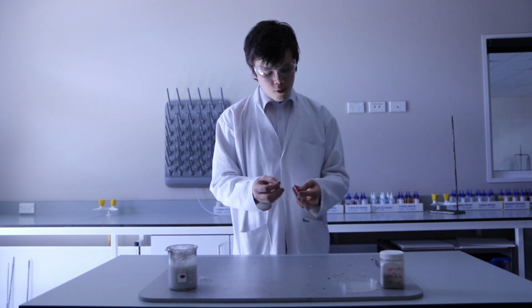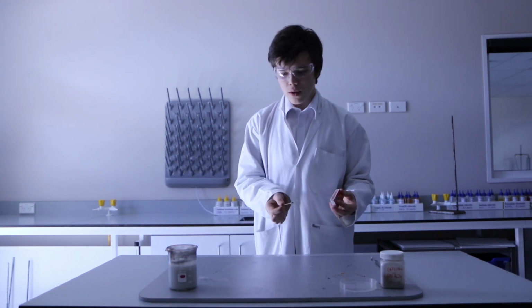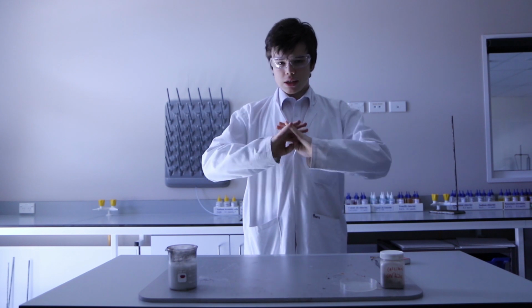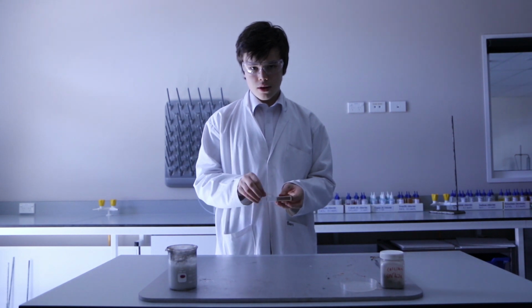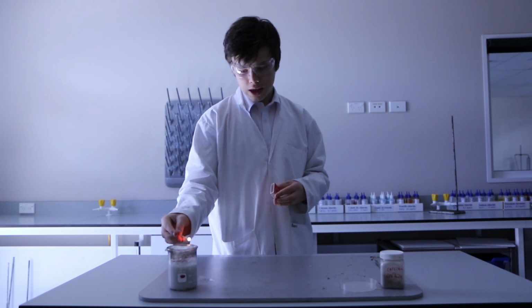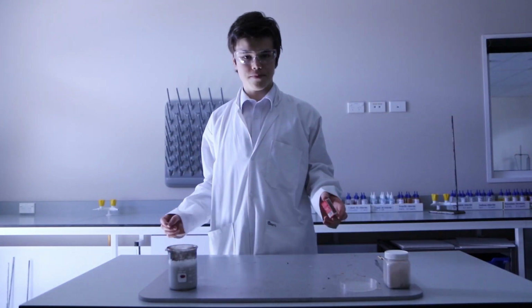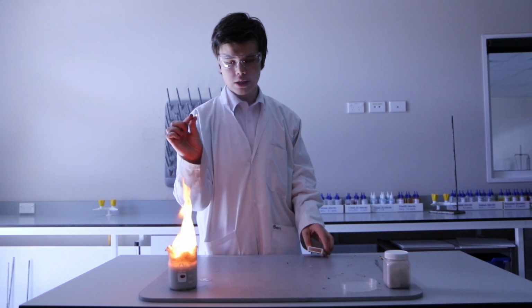And you can see there's still more bubbles being produced, so I can do that again, multiple times. I would have a sleeve. There. Now, acetylene gas is a triple bonded hydrocarbon, and the issue with those is they're unstable, and that's why there is carbon released every time the acetylene gas is ignited.